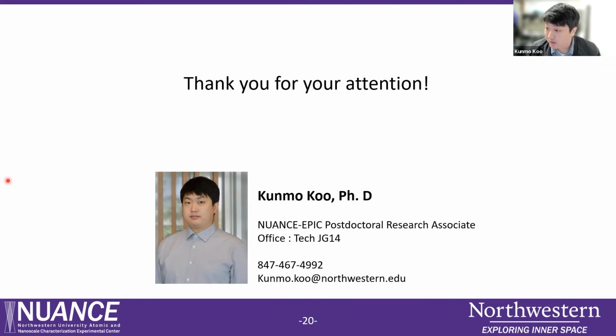Hello, it's a very good talk. Thank you. Actually, can you apply some bias to the actual liquid cell? You mean the bias in the GLC?